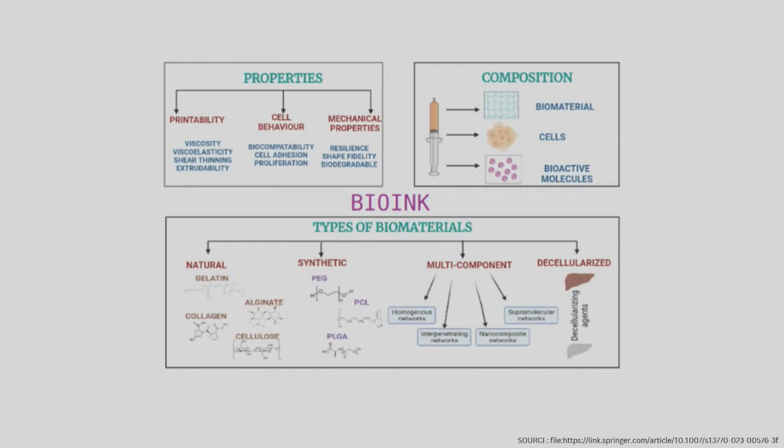Now, if in the cornea I am not making the material stable enough that it can even hold the sutures, then what's the point of even developing the cornea or printing it? So how do I ensure that it has mechanical stability? It is by choosing the polymers correctly, which will give the mechanical strength to the cornea that is getting printed.